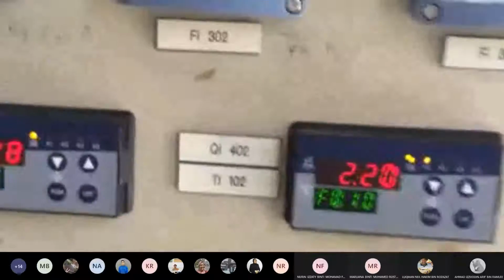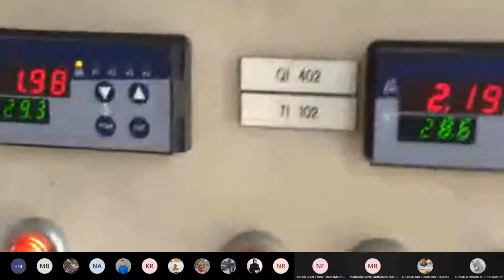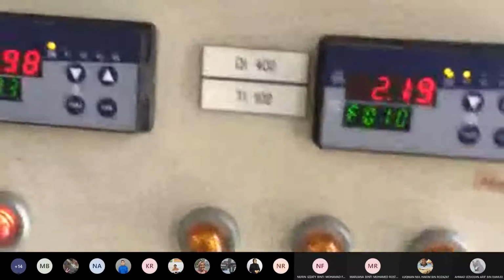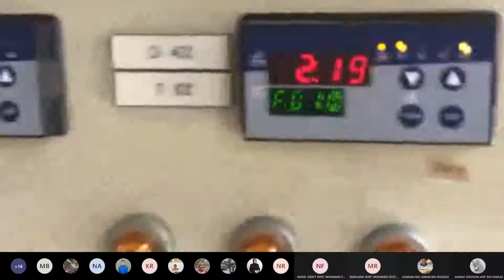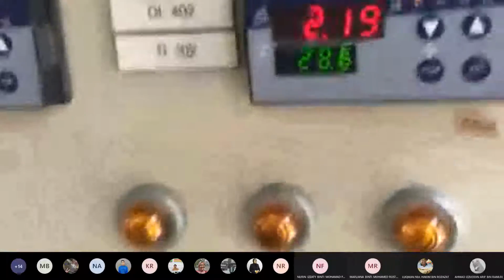So, contohnya dalam sample of result tu katakan eksperimen 1, saya guna eksperimen pertama saya guna flow rate 200 ml per minute. So I calculate the residence time, I get the first parameter. Then second, I change the flow rate, okay, I calculate the residence time, I get the second parameter. So basically, effect tu kamu kaji bila kamu tukar dua parameter lah. Kamu tukar flow rate, 2 kali dapatlah 2 parameter yang berlainan.